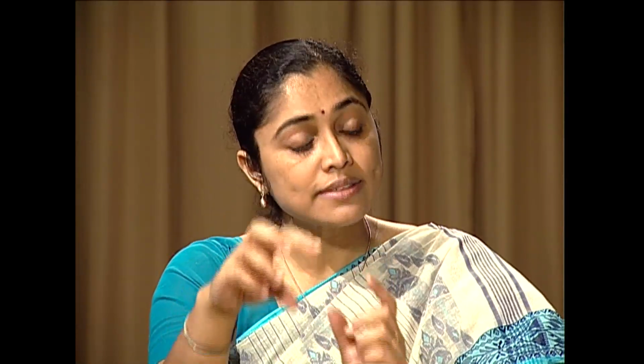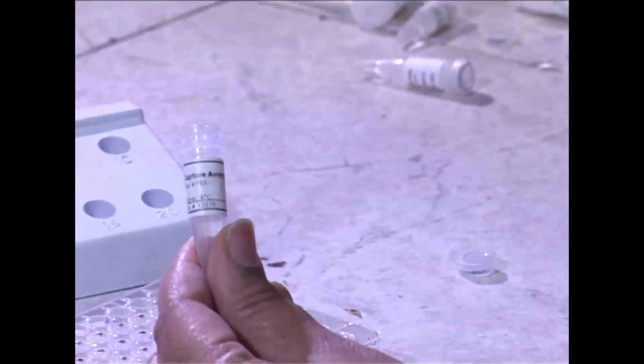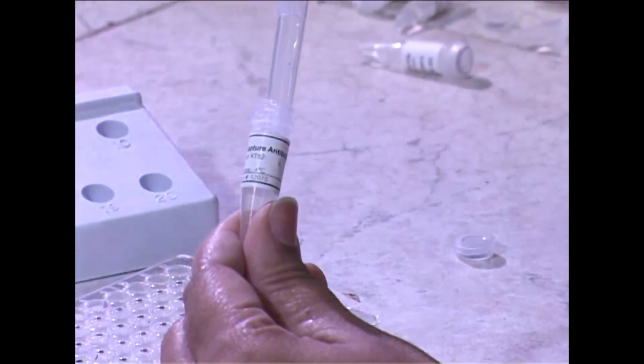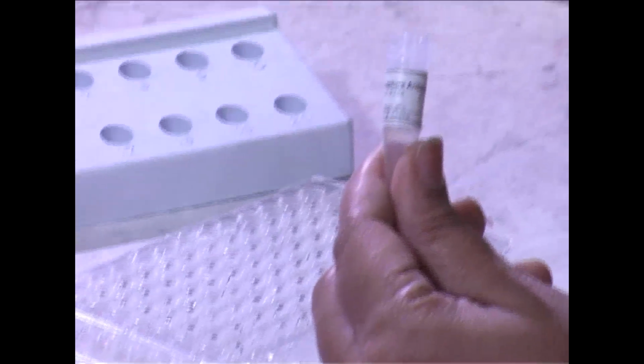This technique involves two antibodies raised against two different epitopes of the same antigen, and the antigen is trapped between the two antibodies. That is why it is called sandwich ELISA. How can we perform sandwich ELISA? First, we have to coat the microtiter wells with one antibody. This antibody is called the capture antibody and it is not labeled.